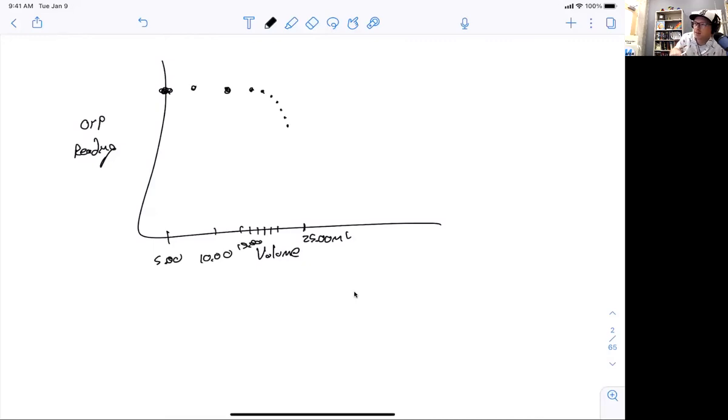Now you might get to the place where you're adding like half a mil or a couple drops. In theory, every 1 drop is about 0.05 milliliters. About 20 drops is 1 milliliter. If you just spin the stopcock 180 degrees as fast as you can, you'll get about 1 or 2 drops.